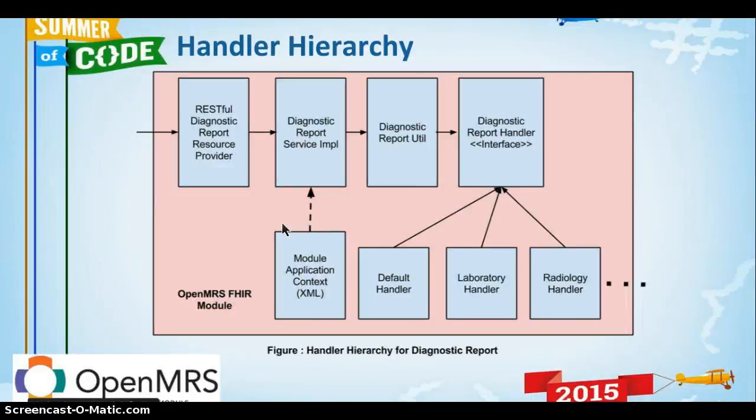As you can see, there is a default handler. When the service category field is not available, those requests will be handled by the default handler. Also, other users can implement their own handlers for other types of service categories. And if they are not happy with our implementation, they can also override it.